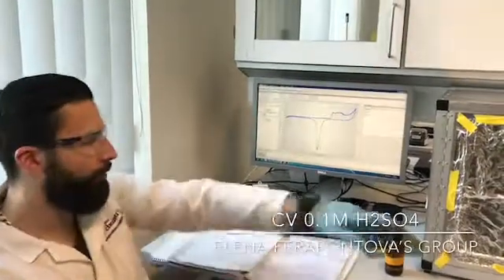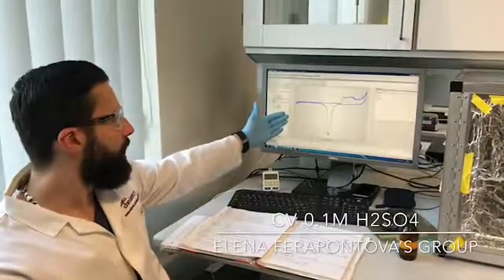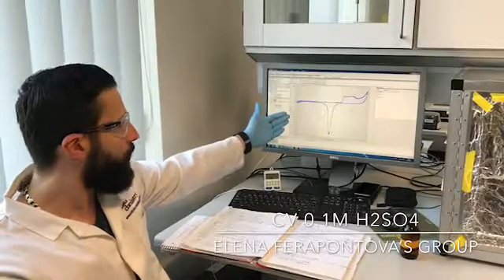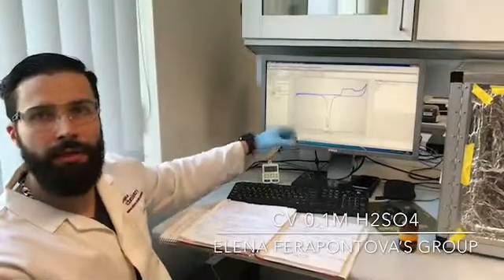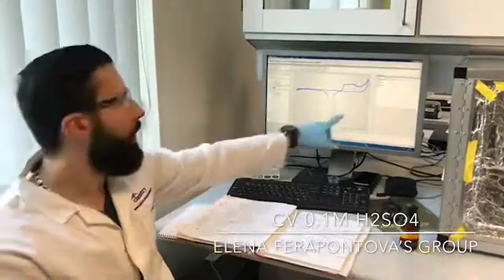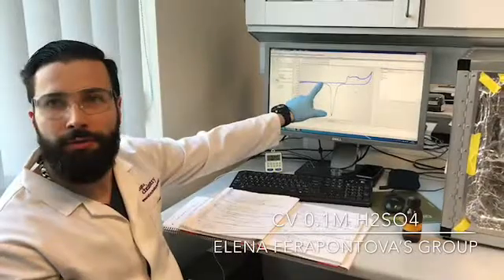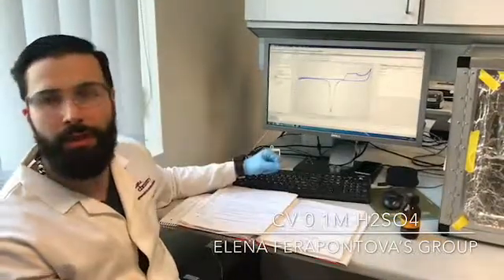In the final step, when you run the CV in 0.1 molar sulfuric acid, this is what you should obtain. This CV was obtained between 0 and 1.5 volts, and the scan rate is 300 millivolts per second. From this CV, you can obtain the electrochemical surface area of your clean gold electrode. You know it's clean when these two shoulders are symmetrical — if it's lagging, you should start all over again because the electrode is not clean. Now you know how to clean a gold electrode, and you theoretically have a nice clean electrode. Good luck with your measurements!